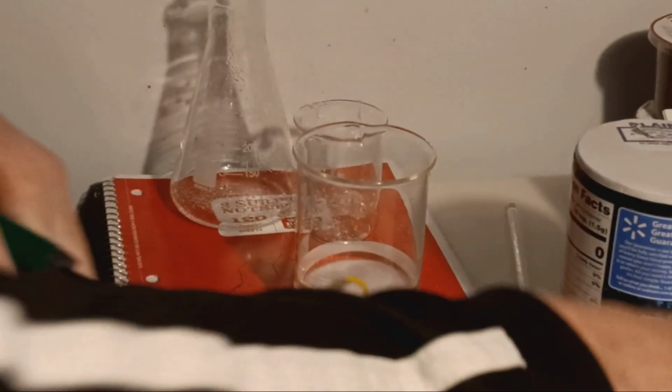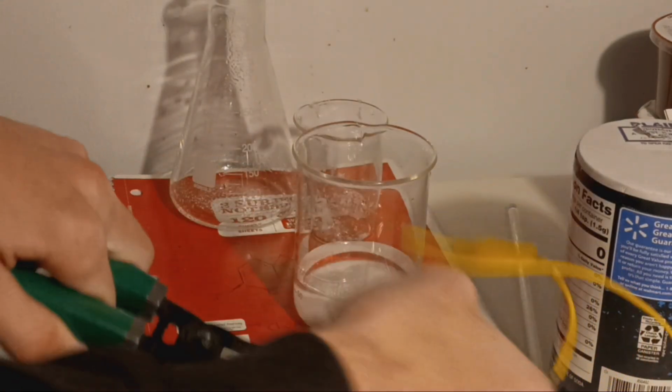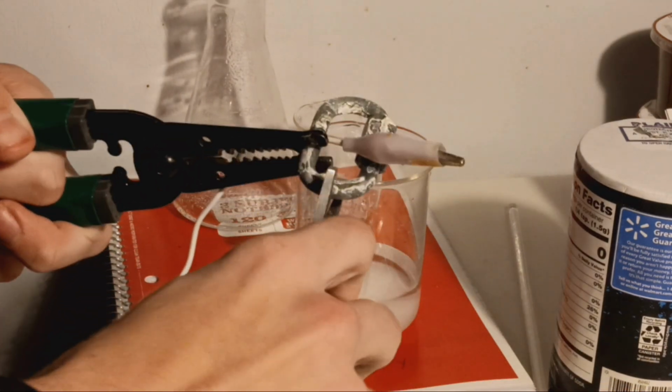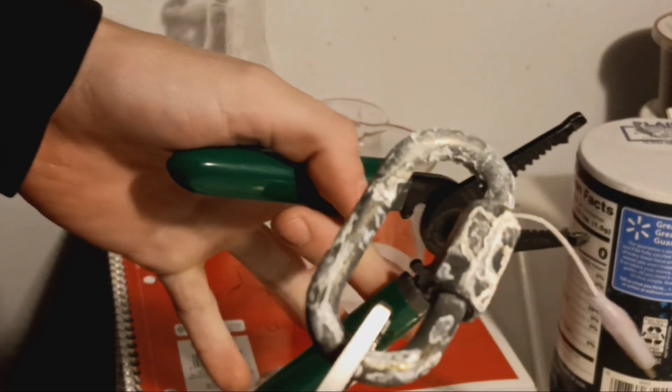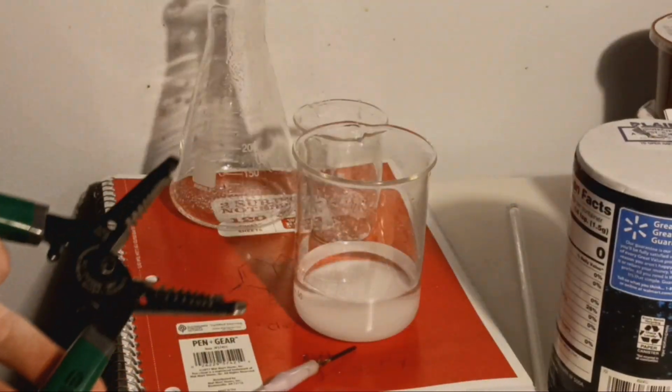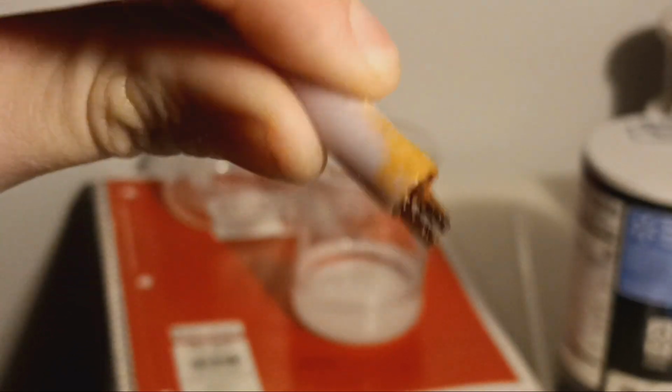The carabiner from last time. There is this strange white formation on it. I can only assume the worst and assume this is something very dangerous: sodium hydroxide. So I take proper cautions while handling, but there is also the possibility that this is zinc oxide or just salt, all of which would be a white substance.